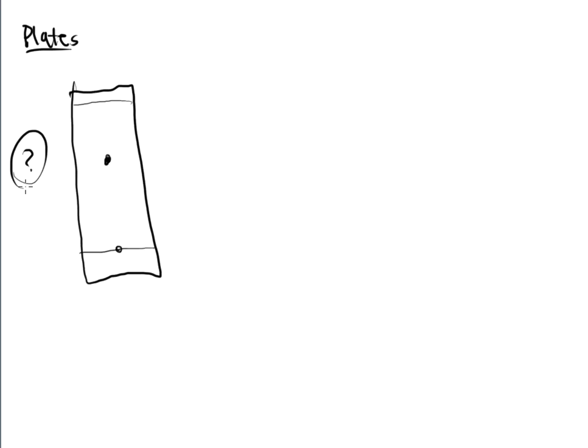You just don't compare how high the spot has traveled. That's not what you do. There's actually a little bit of math that you've got to accomplish when you process these TLC plates. And this little bit of math is going to be pretty important.